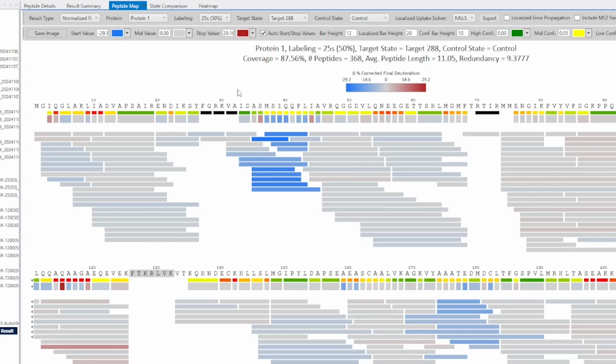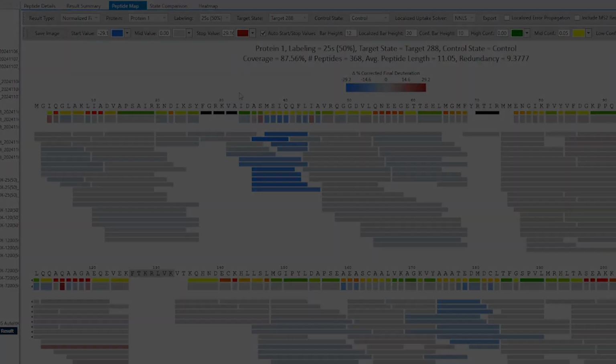Areas of the sequence that are marked black mean that in this zone there may potentially be multiple solutions to these segments, potentially infinite solutions depending on how many segments you have. So the algorithm, instead of just giving one solution, will actually just say it's unsolvable.